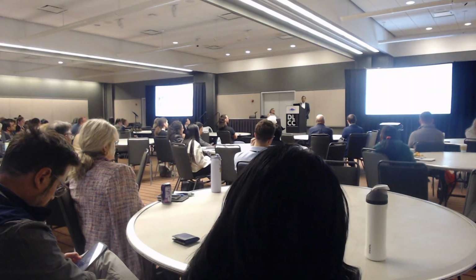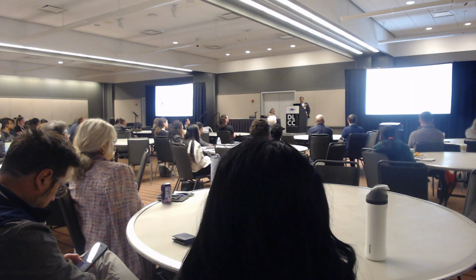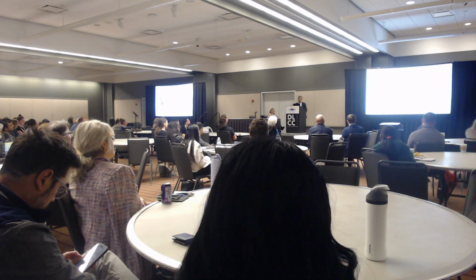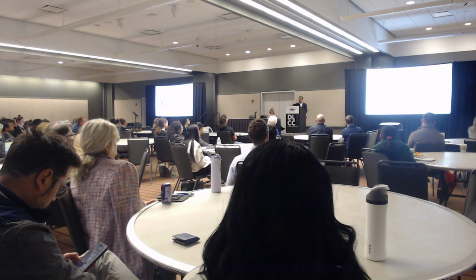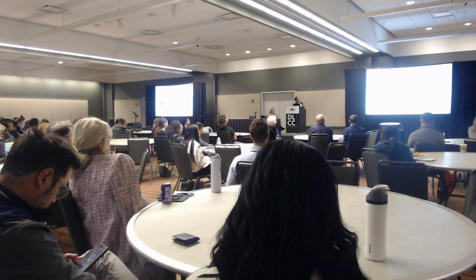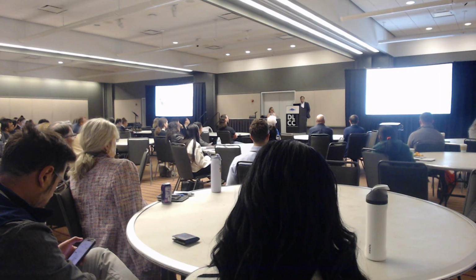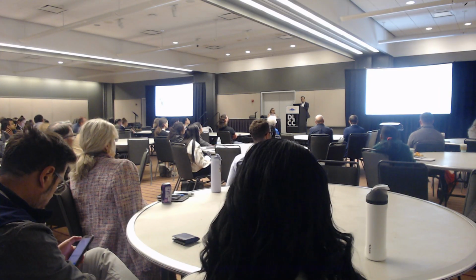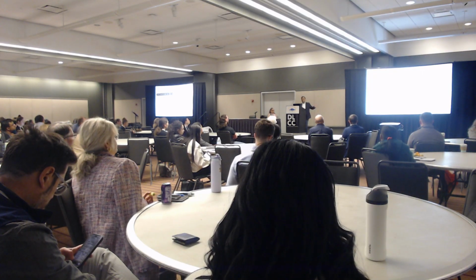But if you have purchased biotinylated nucleotide, you know how expensive that is. If I were to do this experiment using the biotinylated nucleotide, it would cost a lot of money just to run it. So what we did is replace the biotinylated nucleotide with an unbiotinylated nucleotide just to optimize this step. It was a very good learning experience for my technician and for us as well. Now you can see the digestion step, ligation step, and different time points of digestion. We run on an agarose gel, we could run on a tape for better quantitation, and boom, here we are.